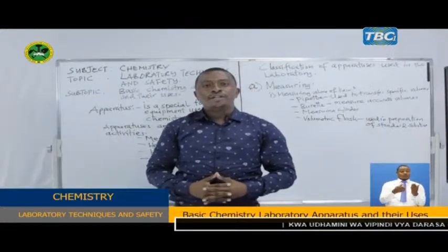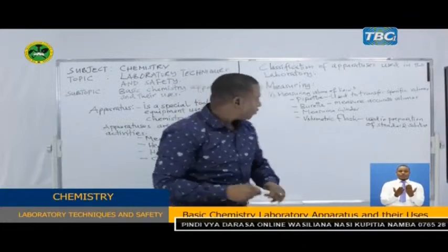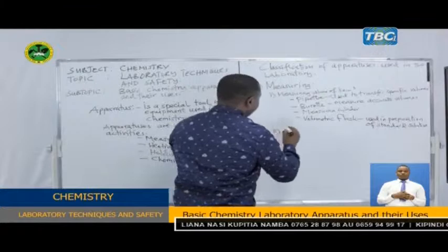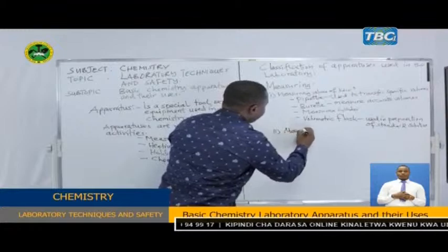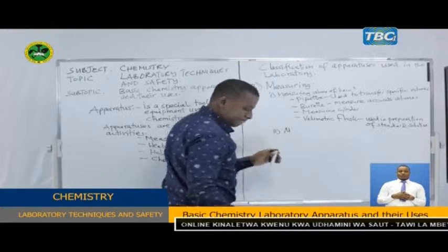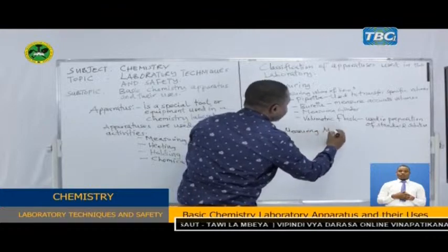Now, dear student, let us see the other apparatus used for measurements. We have apparatus for measuring mass.